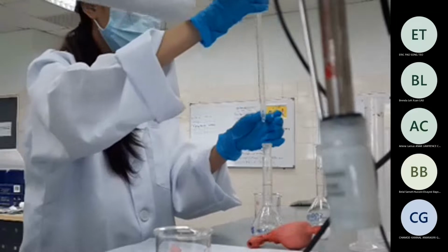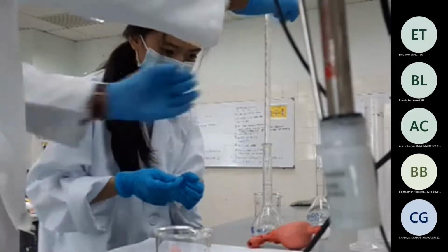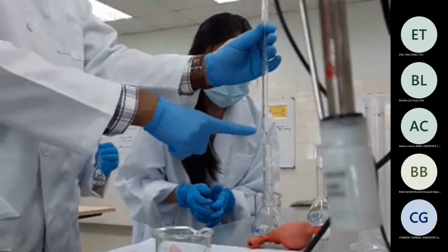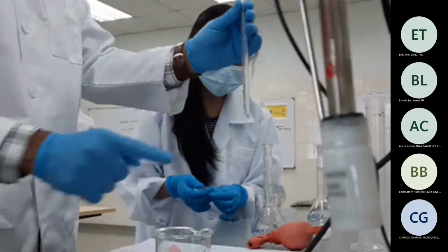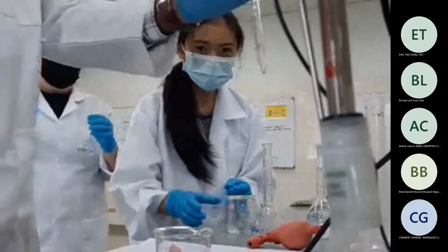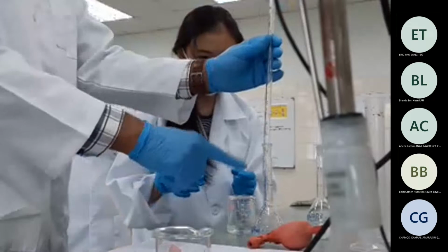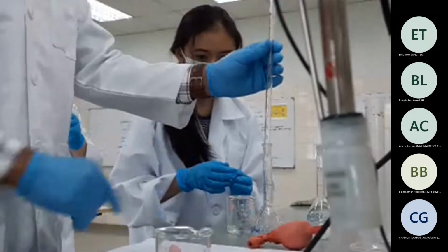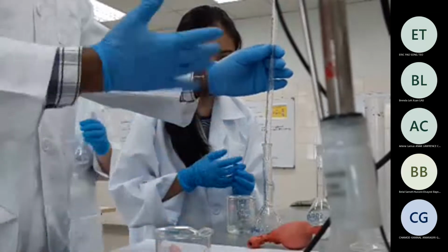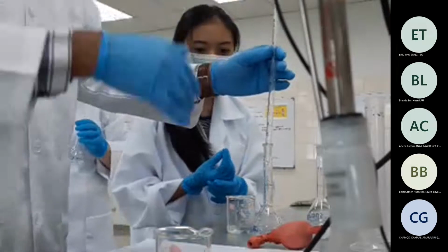Hold on, just one trick I'll show you. Lynn, come here. Vanessa, come here. At the end, there will be a little bit of liquid here, and it is very hard to get it out. Don't force it out, because it is the remaining part of the meniscus that we just took. It was concave, right?